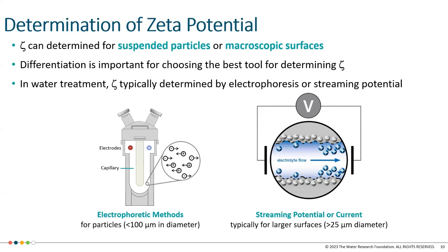And so in these cases, again, if you have a very low concentration of particles in your suspension, this is where you really want to work with the manufacturers and do some piloting to get a sense of the best way to ensure that you're getting the most meaningful data with respect to an assessment of surface charge, and in the case of coagulation and subsequent sedimentation and filtration, really making sure that you have an adequate coagulant dose so that you're sufficiently destabilizing the particles for subsequent treatment.